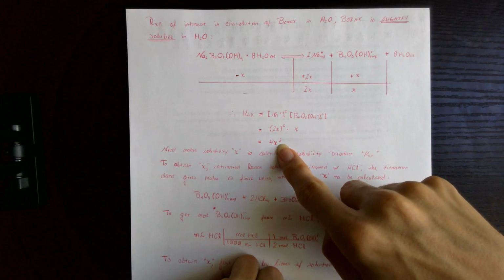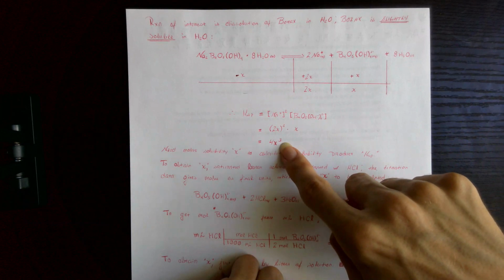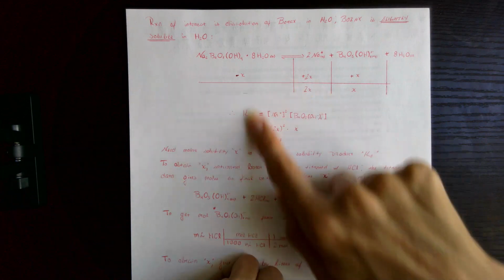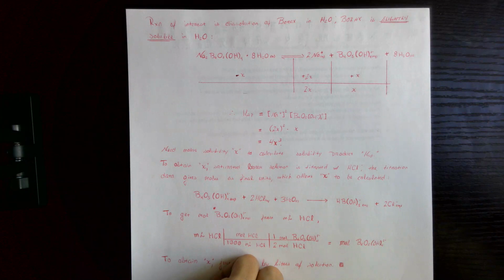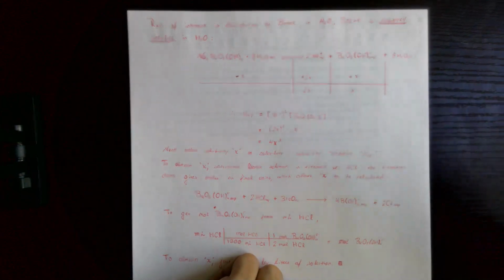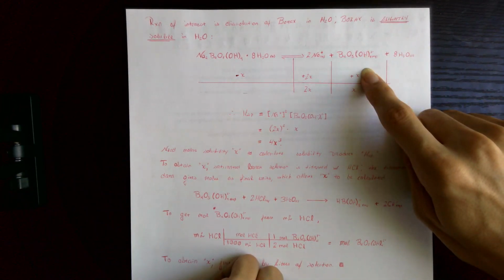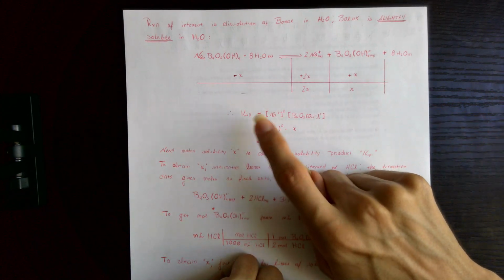This is why I've been so hardcore about solubility products, because you have to be able to see where this comes from and know the difference between solubility product and molar solubility for this to make sense. So the whole experimental portion of the lab, like what you would have actually physically done if you've been in the lab, centers around determining how much of this is in a solution at a given temperature. Because once I know that, I can calculate the solubility product at that temperature.